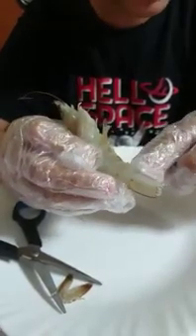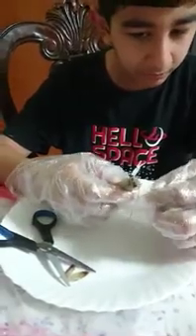Sex determination. Shrimps use this, and the female has this. As you can see right here, they have like a tiny little hole right here. And males have somewhere next to their jointed legs or fins, like a sharp spike right here, or in this jointed leg. I don't know where it is because I have a female shrimp. As you can see, there will be like a tiny little hole here, and they will put this here. And yes, that's all I learned.